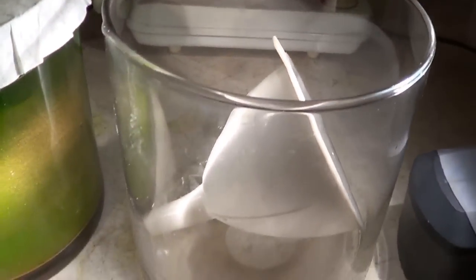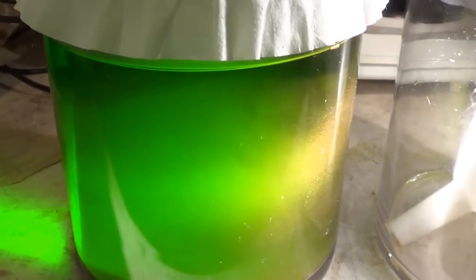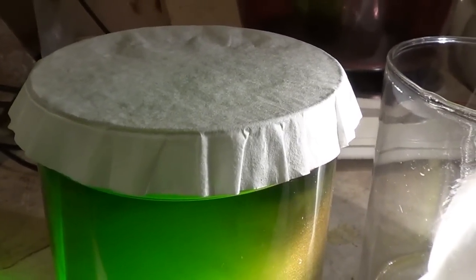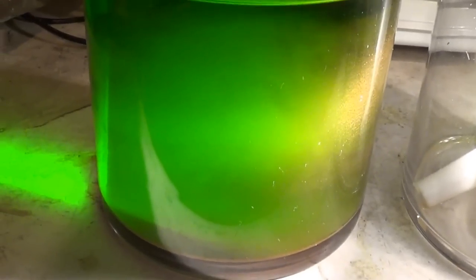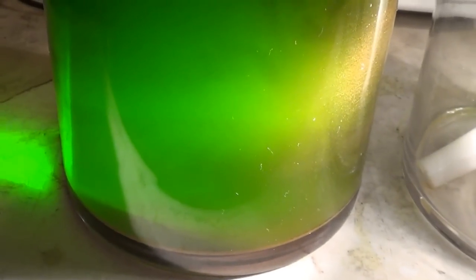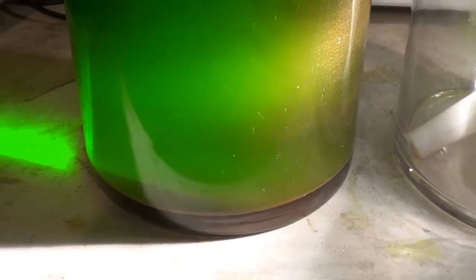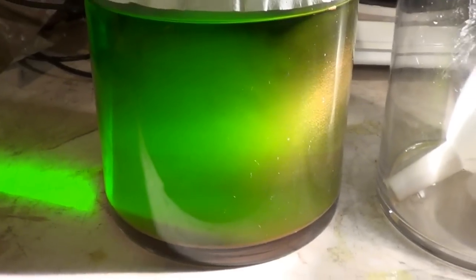I'm going to decant this into another jug of the exact same size, filtering away, then I'll be spritzing the inside of this container and getting all the gold out, filtering it all the way through. Then I'll be taking those filter papers with the collected gold, putting it into my crucible, and turning it into a gold bar - which should be awesome. Right now I'm going to decant it and I'll get back to you again soon.